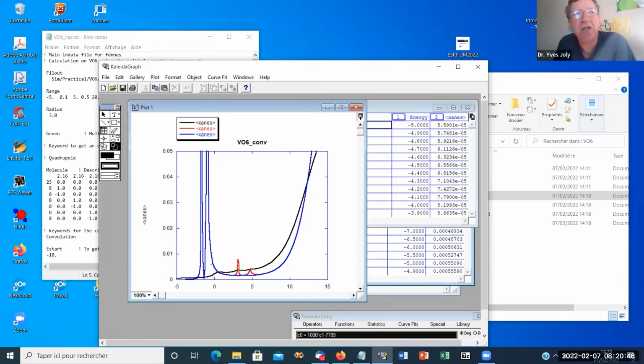So at the K edge, your initial state is 1s, that is L equals 0. So what you probe, plus 1, it's L equal 1, it's a p state. So what is probed in practice for a 3d element? It is the 4p states. For the quadrupole, you could have -2, 0, or +2, but at the K edge, it's only +2 delta L.